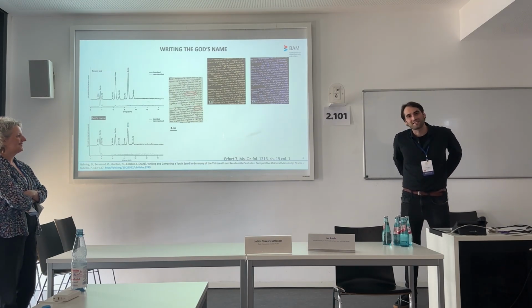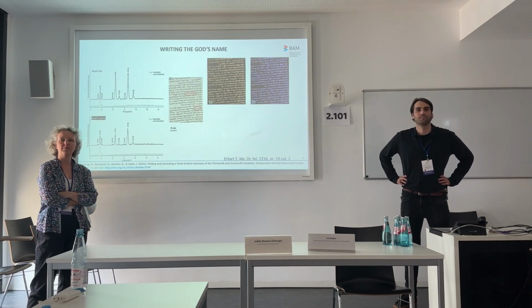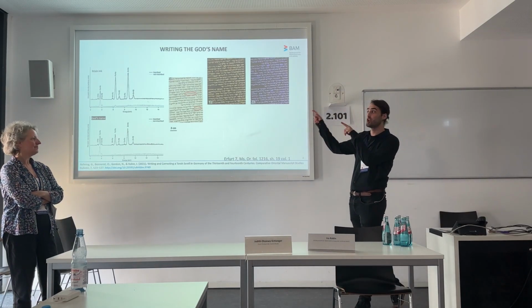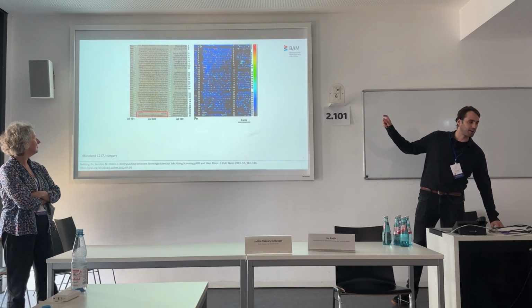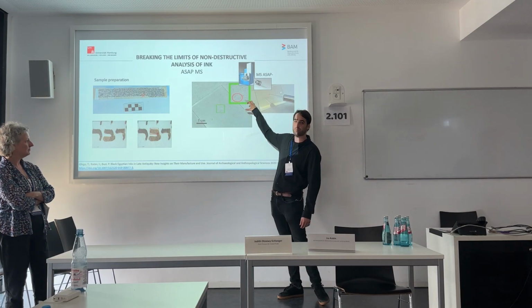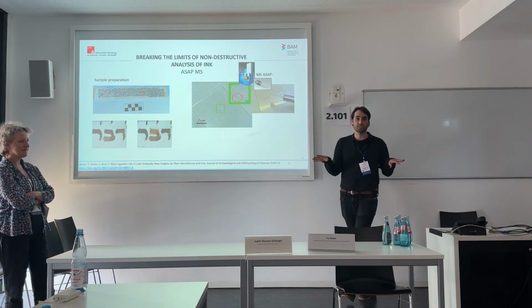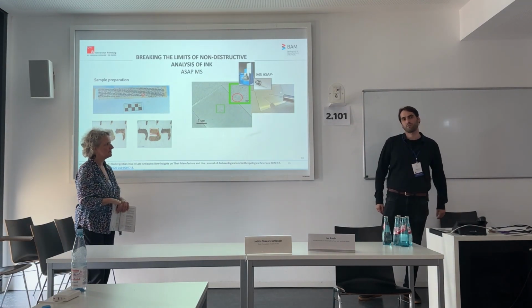Okay, interesting. The second question was, is there any sort of damage from all this zapping? No. So first of all, non-invasive. At the very end of the presentation, I showed how we break the limits of the non-invasive analysis. In this case, we need a couple of little particles from the ink for this analysis. However, for all the previous study, it is non-invasive, non-destructive. We are not even in touch with them.